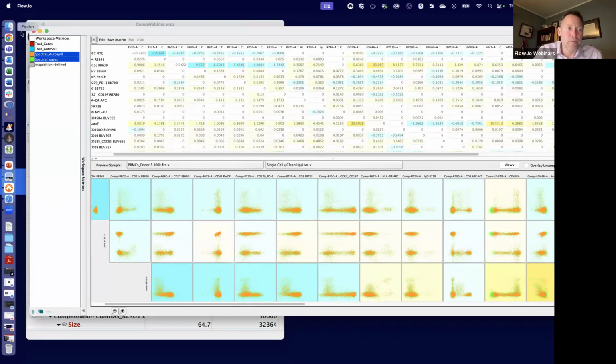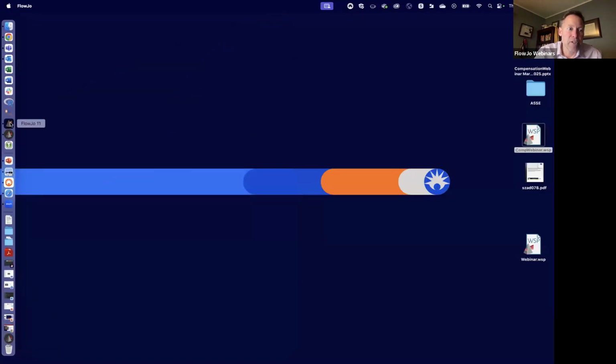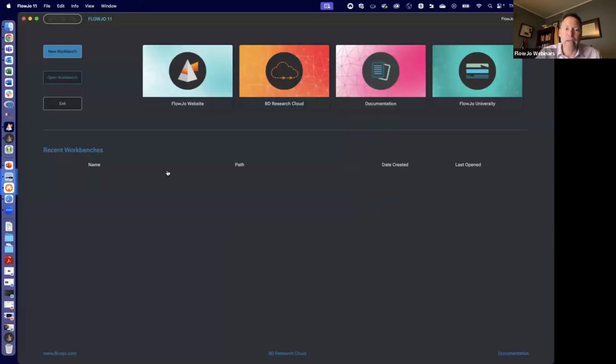Okay, we're going to go a couple more minutes here. That is the V10 version. I just want to show you the V11 version. That is coming in the end of May or so. Okay, so V11, immersive, has dark mode, etc.